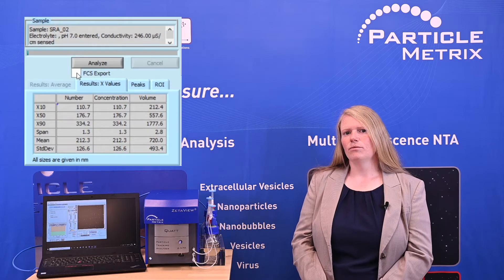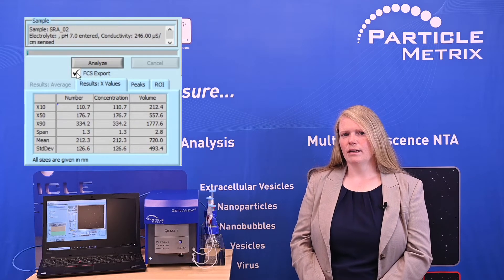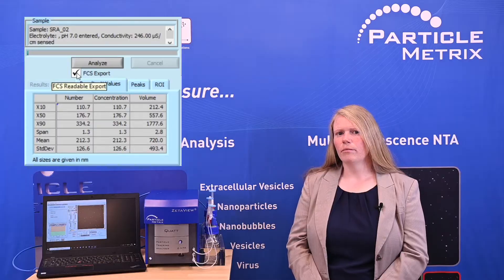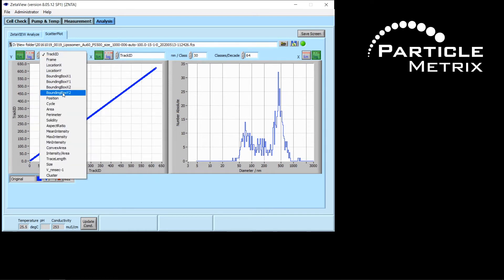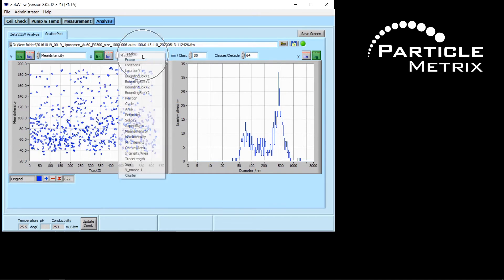Since the ZetaVue can export data in FCS form, we can build up dot plots for further analysis like evaluation of subpopulations. A lot of different variables can be chosen.